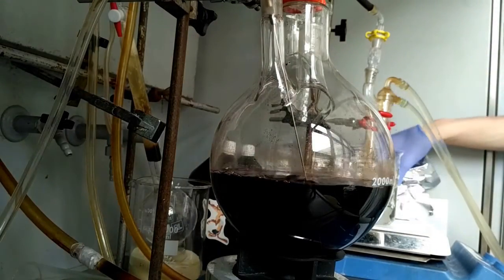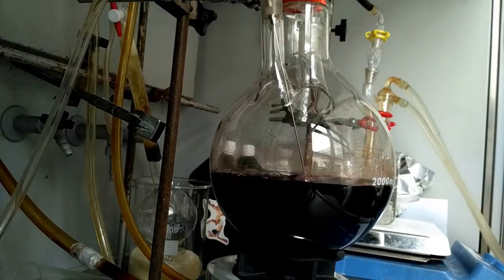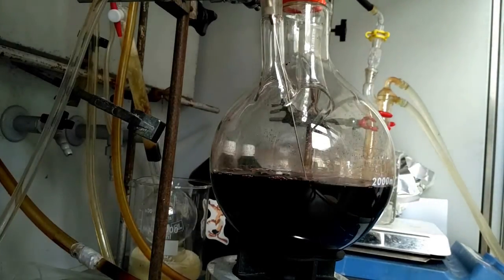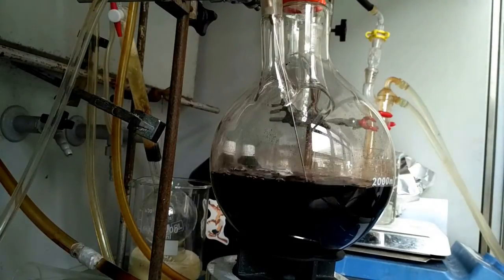After 2 hours, an excess of an oxidizing agent, DDQ, is added to the reaction mixture.